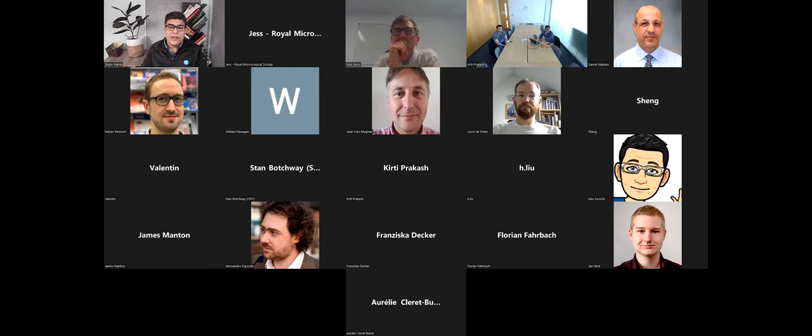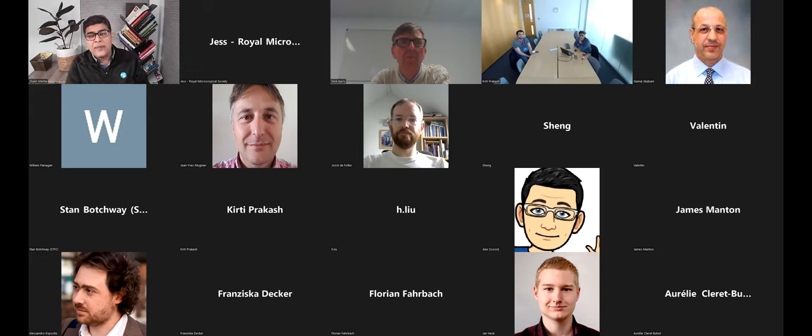I think the last question, Nick, is from you. Yeah, so I just wondered if on this microscope, you've got an objective and a condenser. And usually the lower one is what's limiting. Is that the case? Yeah, that's a great observation. So the resolution in a transmission microscope is governed by both the NAs, the imaging NA, as well as the illumination NA. And the effective NA that governs the resolution is the sum of both of these NAs.